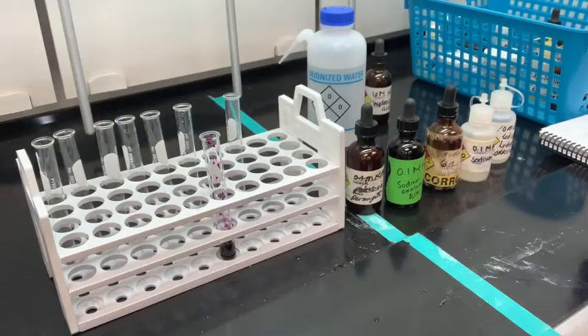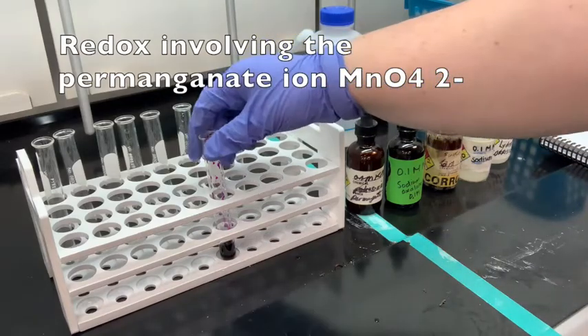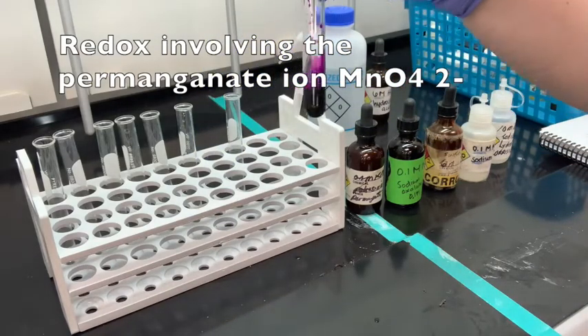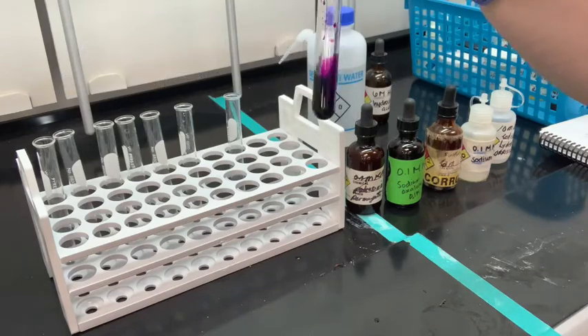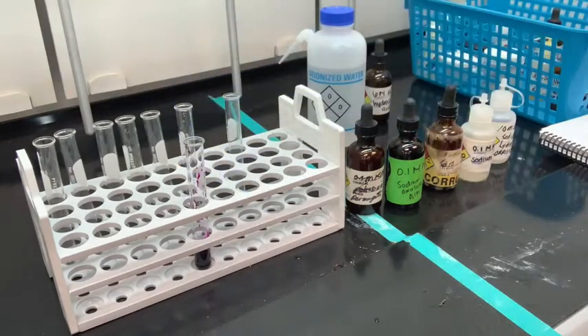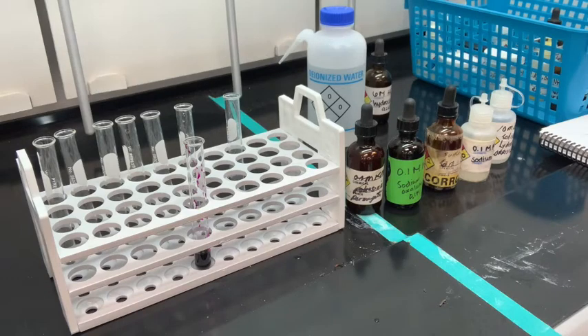Our last set of redox reactions, or oxidation-reduction reactions, have to do with permanganate. We have a test tube here just to see the color of potassium permanganate — it has a very bright purple color. Starting with the bottom of page 59, potassium permanganate, KMnO4, that purple stuff in our test tube, is an excellent oxidizing agent in acidic medium.